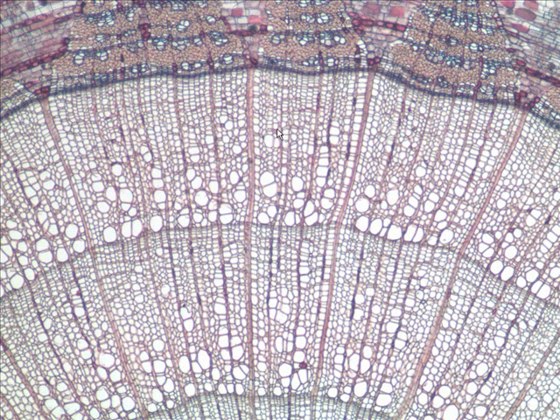Secondary xylem, and is it the youngest or the oldest? Well, it's the opposite of the one on the inside. And so this is what? This is the youngest ring. As opposed to the one on the inside, it is the oldest. How do we know it's the youngest? Well, what is forming the secondary xylem? This vascular cambium. And what is just outside the vascular cambium? The what? The secondary phloem.